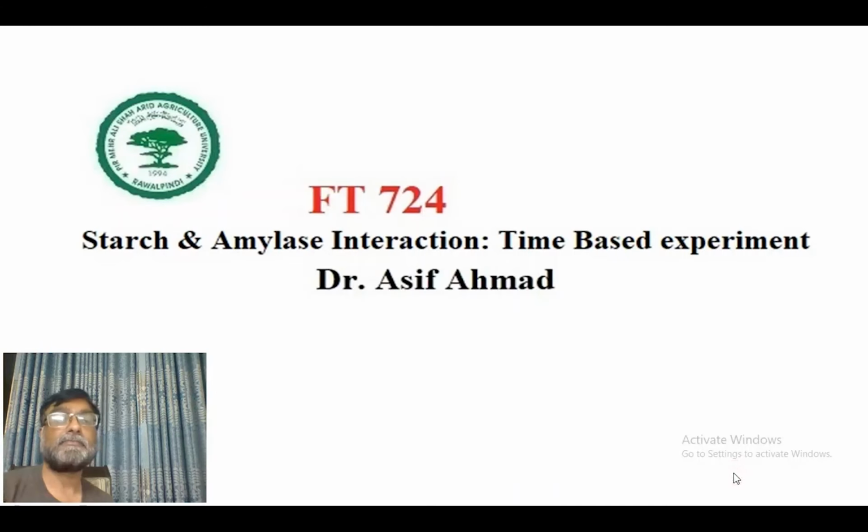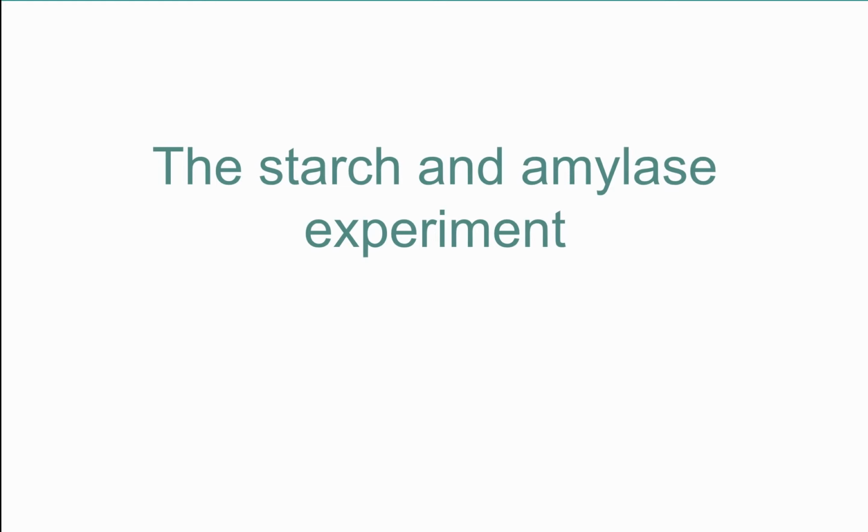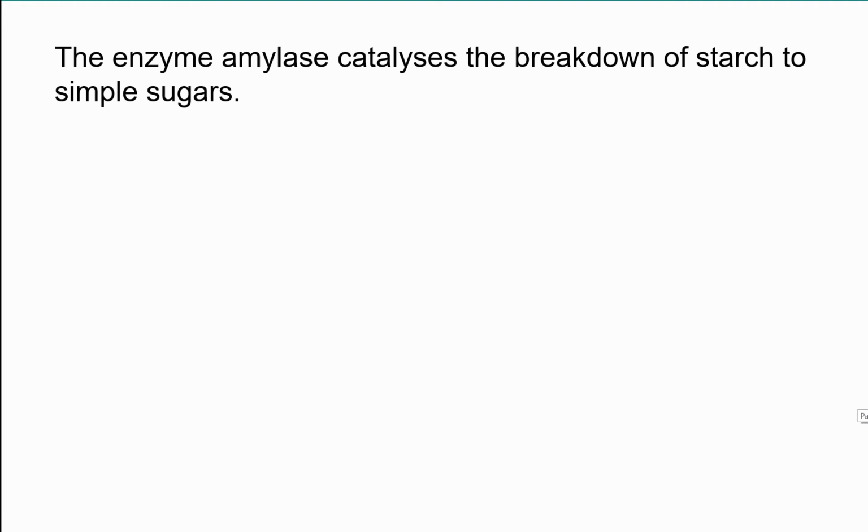Hi guys, today we will be discussing another experiment, the starch and amylase interaction. It's a time-based experiment. In the previous experiment we saw only a simple interaction between starch and amylase, but today we will be looking at time-based phenomena with these reactions. So let's start with the experiment.